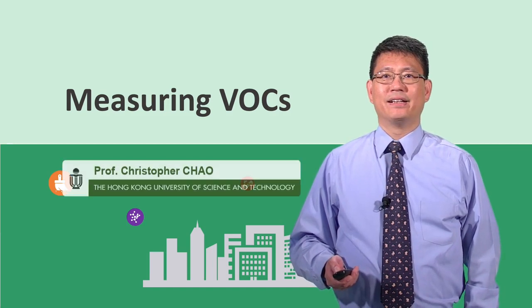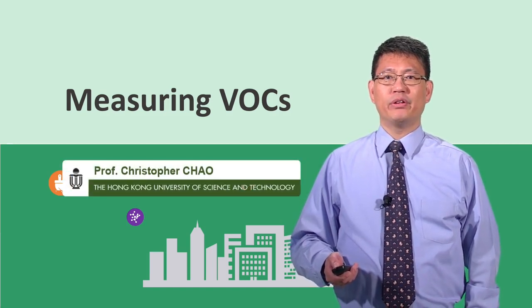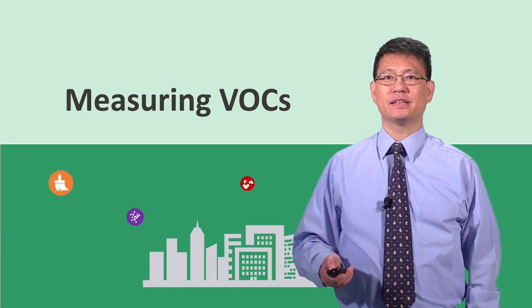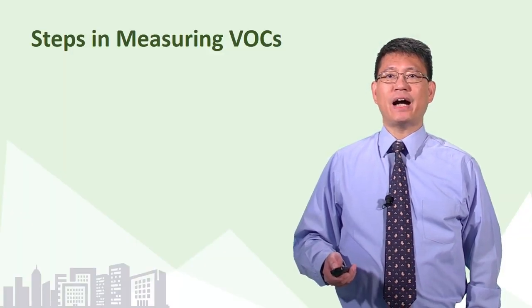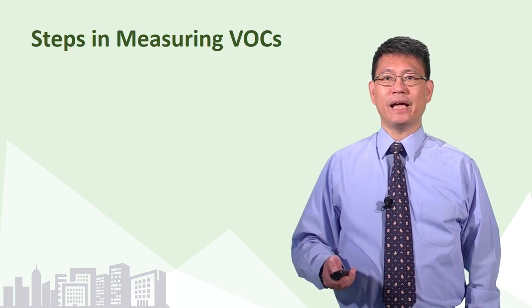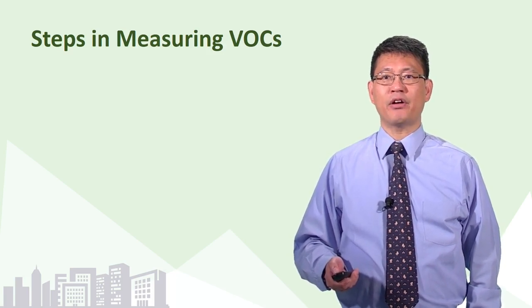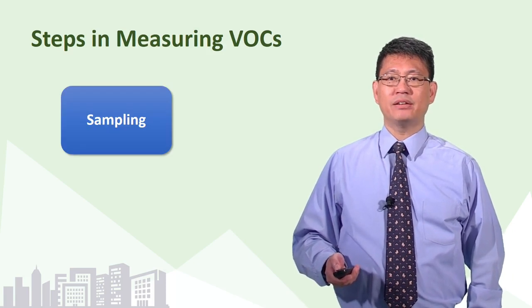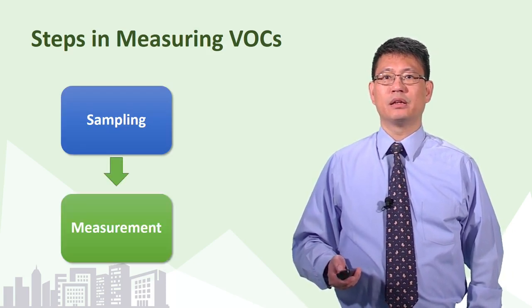Hello everyone. In this video, we will learn how to measure the concentration of VOCs. To identify the VOCs concentration and content in an environment, we first perform sampling. After that, we perform measurement.